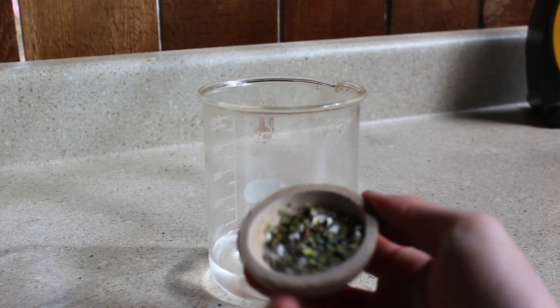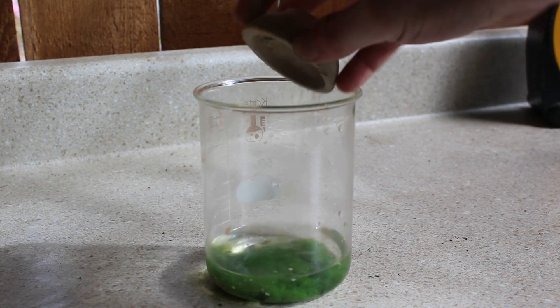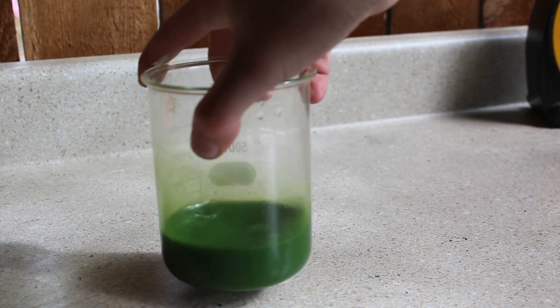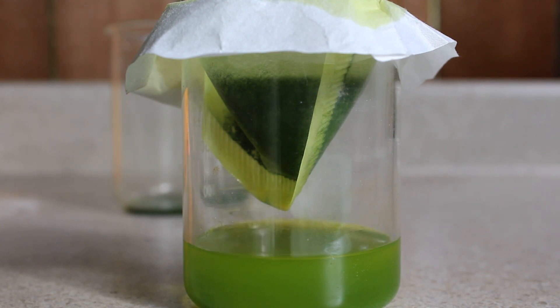I take my mixture and I dump it into water. This dissolves the sodium chromate and it also dissolves the leftover sodium carbonate that did not react. I filtered the solution to try to get as much of the chromium oxide out as I can, but you can still see that the solution has a little bit of a green tinge to it, and that's very fine particles of chromium oxide that still made it through the filter.